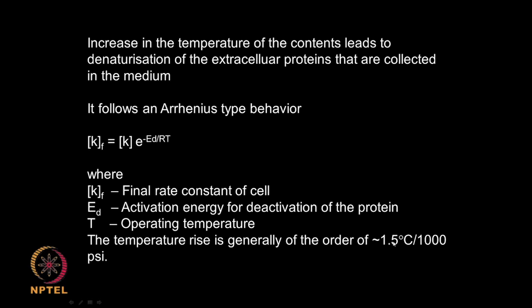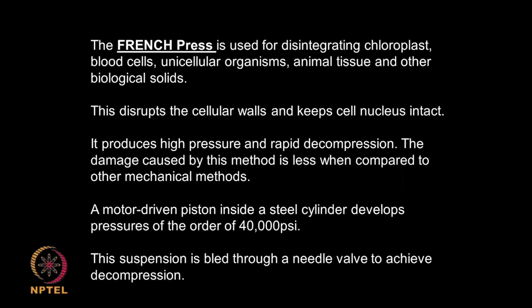So, generally they say about 1000 psi can give you a temperature rise of the order of 1.5, and especially for enzymes and proteins, a temperature rise is leading to deactivation of the product, okay. So, that needs to be considered.